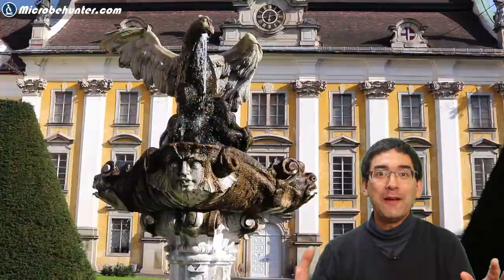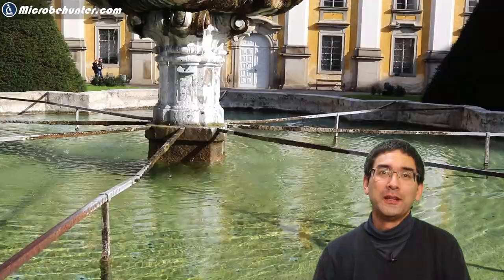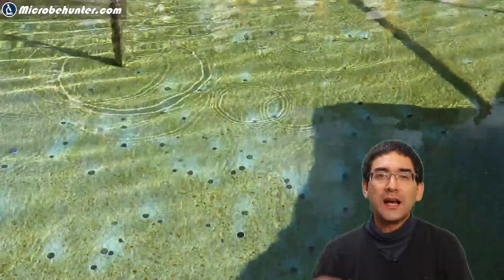And I found this ciliate in this beautiful Baroque fountain. And on the ground of this fountain, look carefully, you're going to see a lot of these copper coins. And around these coins, you're not able to see any algae growing. So I'm gonna explain later on in the video why this is the case.